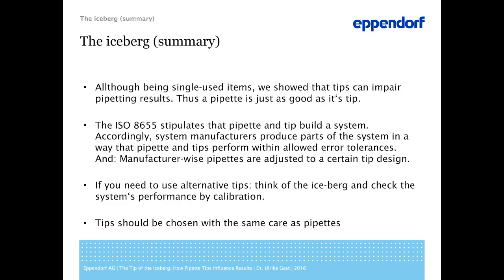If you need to use alternative tips, we strongly recommend to calibrate the system. In documentations and publications, the used liquid handling system should be named. And finally, always choose your tips with the same care as you choose your pipette.